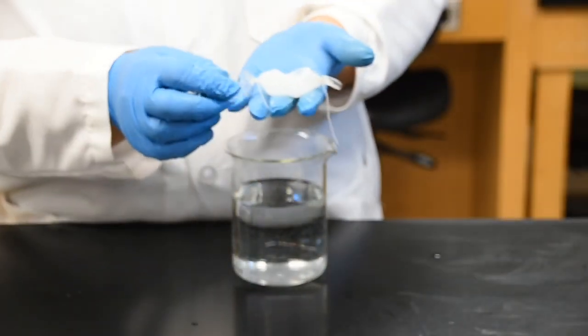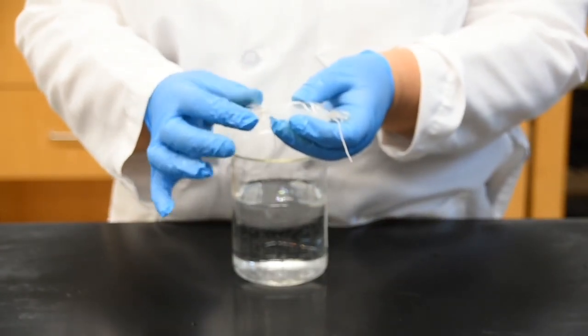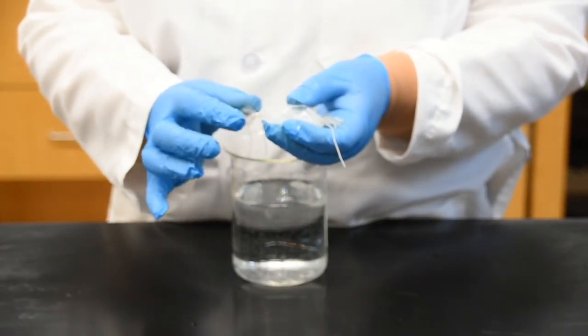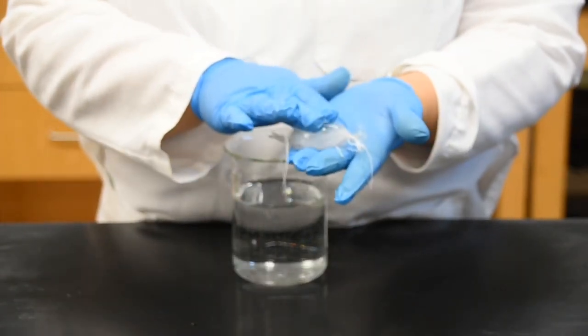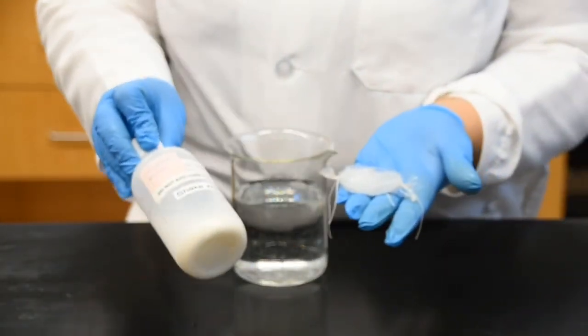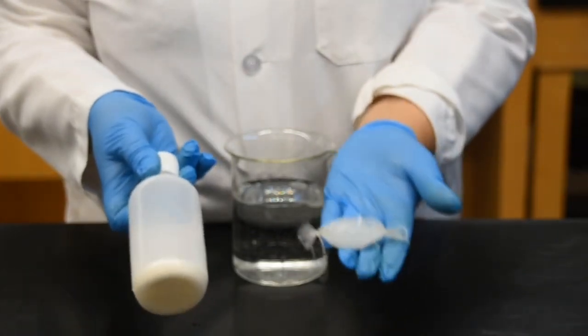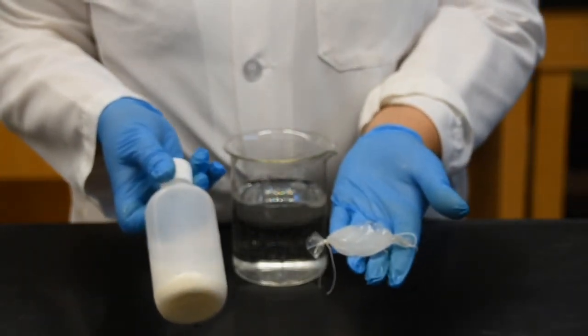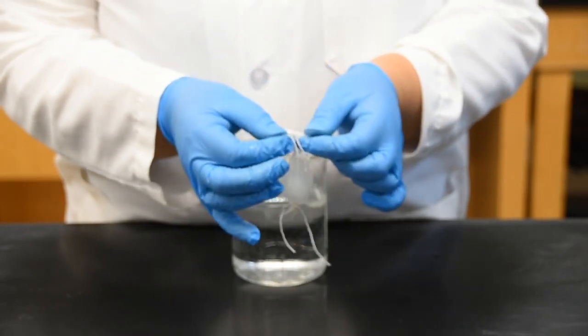So here in this bag, what I've done is I have tied one end of this using a string. I want to make sure nothing leaks out. And then what I have added into this baggie is a solution of 10% starch. So here is my 10% starch. You can see the cloudiness of the solution in the container as well as in here. And then I went ahead and tied the other end of this sample as well.